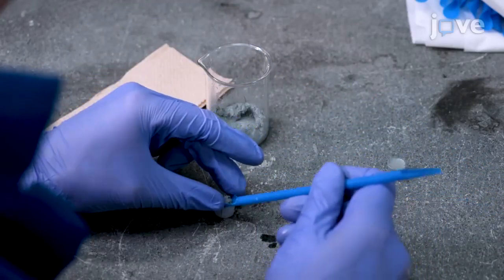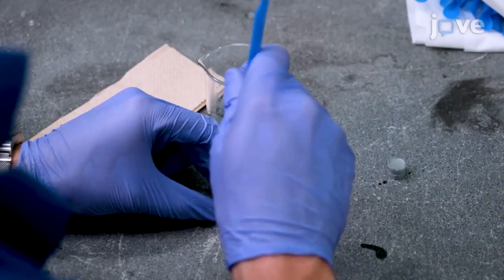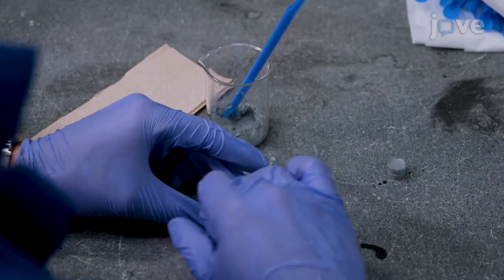Portion the zinc paste into polypropylene molds of approximately 10 millimeter diameter and 5 millimeter height to air dry the paste overnight.